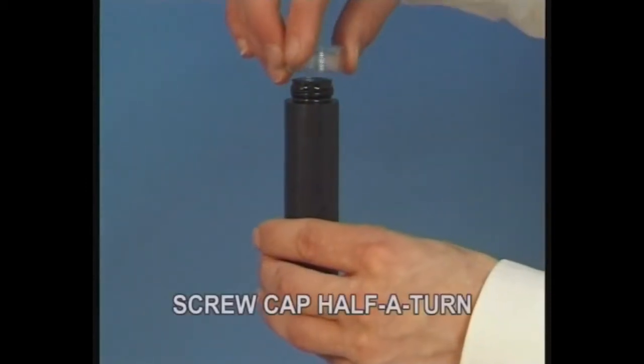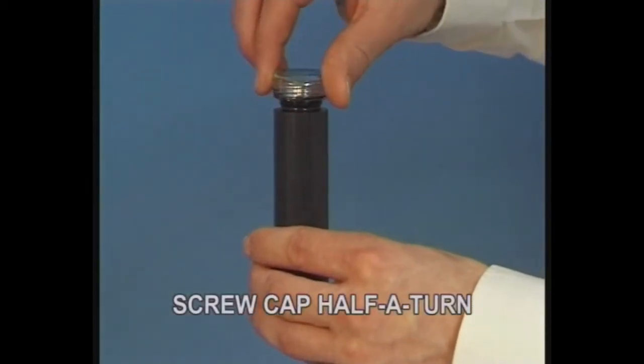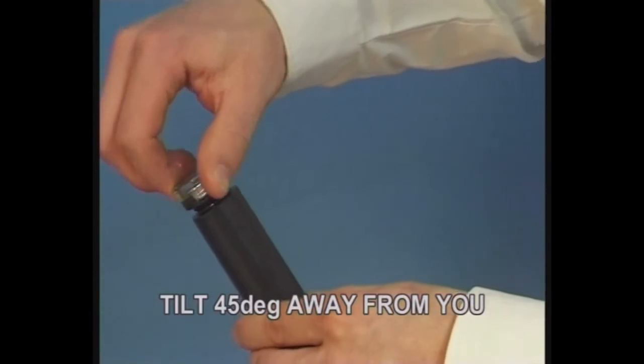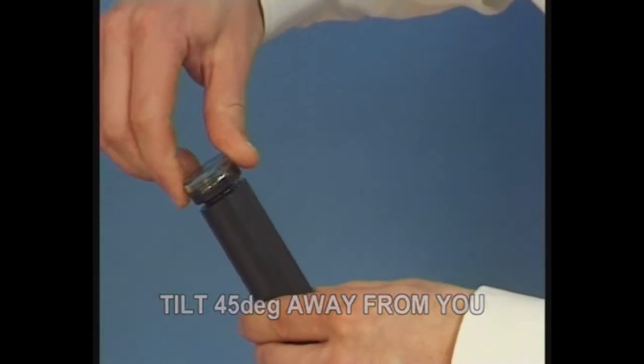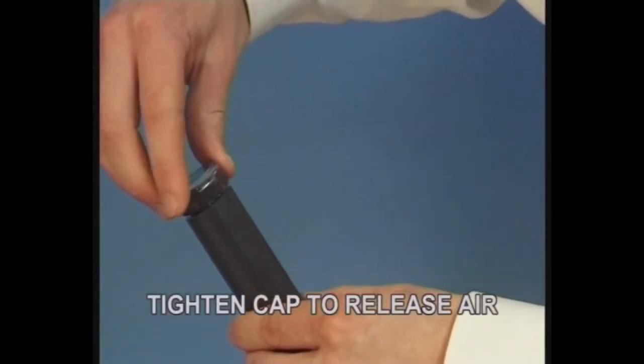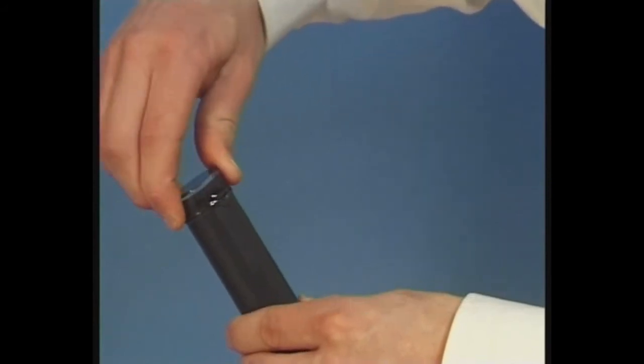Screw the end cap on half a turn. Tilt the tube away from you at an angle of 45 degrees. Tighten the cap in this position to ensure all the air is expelled.